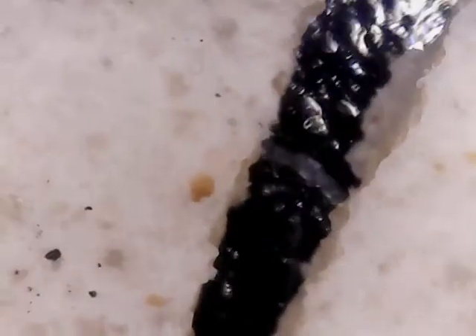There's actually one up top too, and over here there's a tear. You can see all the little specs where it got even slightly too cooked, which isn't a problem normally, but over here it's a little more cooked than the rest, and there's a black spot. I recommend you don't show this to anyone under the age of like 10 because then they won't want to eat tortillas ever again. But yeah, this is a corn tortilla.